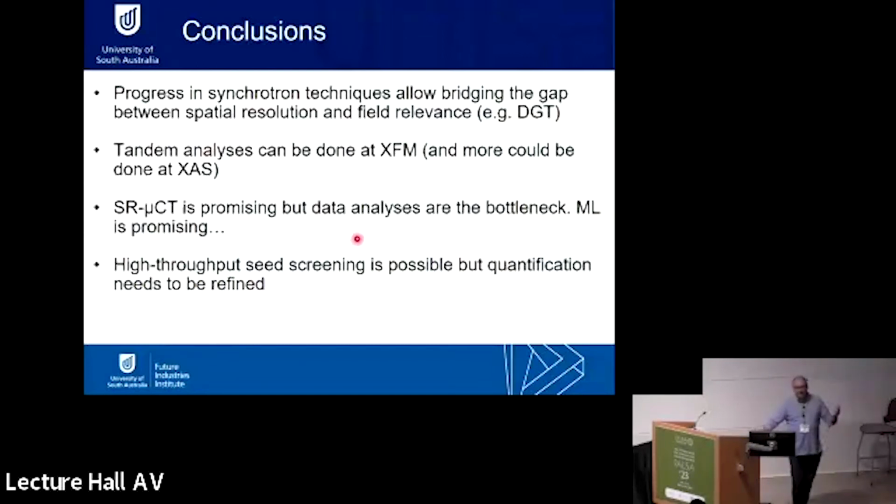We always collect the spectrum from a foil downstream of our sample. But we still probably can have another set of samples just after the first one, and probably still collect a very nice spectrum. If the samples are right and are diluted enough and so on, you probably can do that. It's probably cheaper than building another beam line, really. And for XFM, definitely it works pretty well if you have the right samples to analyze.